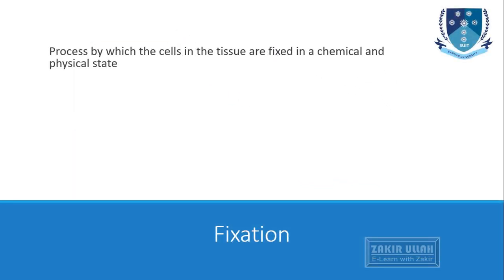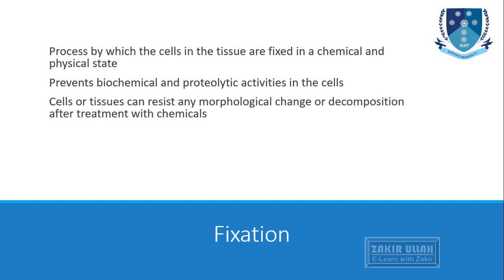So basically, fixation is the process by which the cells in the tissue are fixed in a chemical and physical state, and this process prevents all the biochemical and proteolytic activities that occur during life inside the cells. So fixation tries to stop and capture all the original conditions of the cells, or near to the original conditions. Cells or tissues can resist any morphological change or decomposition after treatment with chemicals.